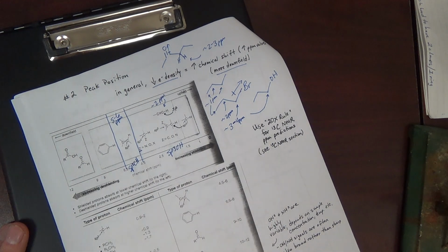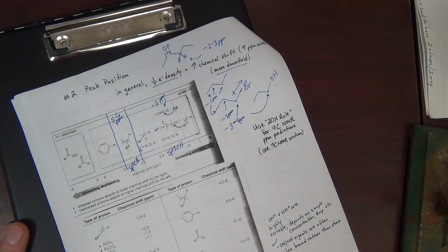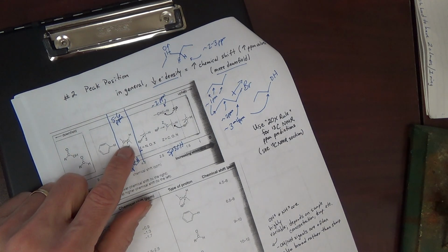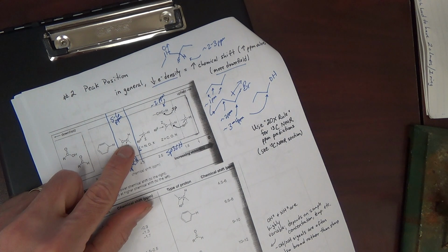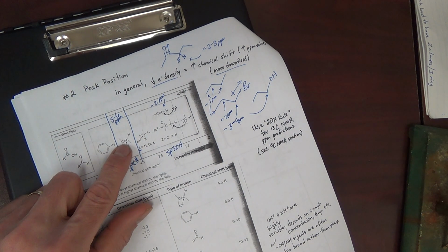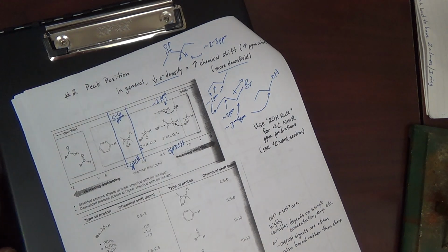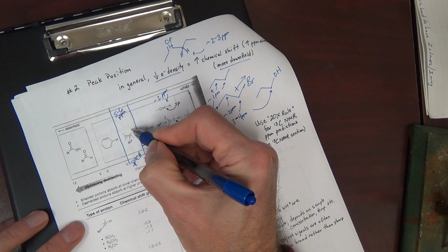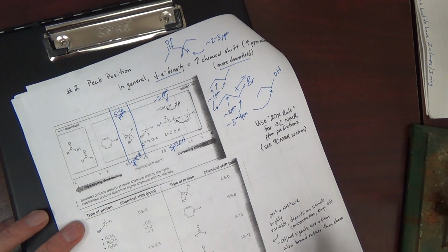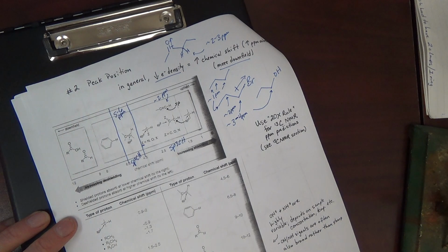They're more downfield, not so much because of an electron withdrawing group, but because the carbon being sp2 has more s character. And so the electrons of the carbon are held tighter to the carbon, and those electrons are not able to be as close to the hydrogen. So that's my argument there. It's a hybridization effect.